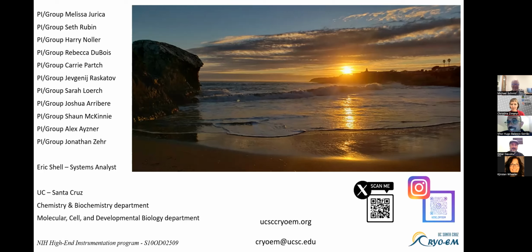Then that was the time when it was like, okay, this thing is not working, so let's change the methods. So we started doing cryo-EM. Actually, it was negative staining at the beginning, so the majority of the first two papers came from negatively stained samples. After that, we looked at how many tRNAs and how SelA binds. The second part of my PhD was trying to do the cryo-EM structures of that.